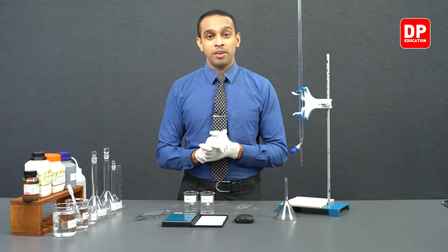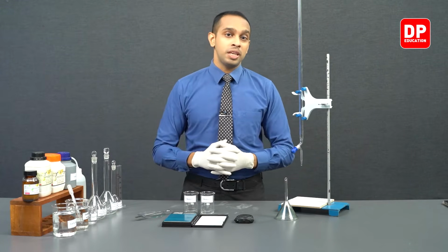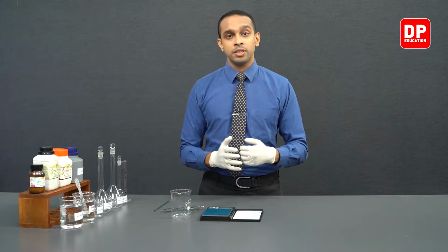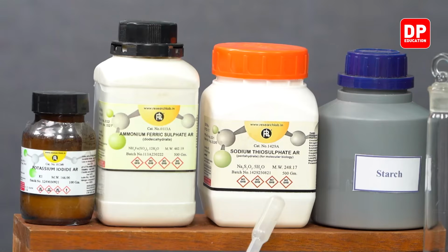So students, we have now identified the equipment and the chemicals we'll be needing for this experiment. Now it is time for us to move on to the next step. When we are carrying out this experiment, we need 3 different solutions: potassium iodide solution, ammonium ferric sulfate solution, and sodium thiosulfate solution.